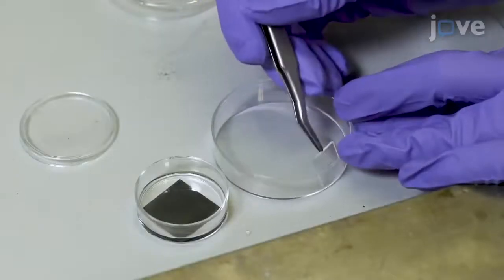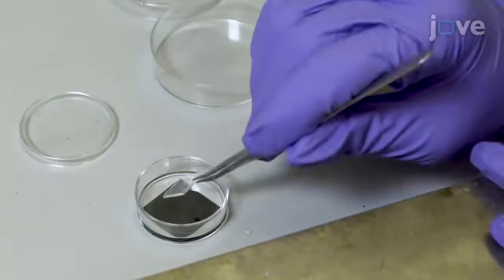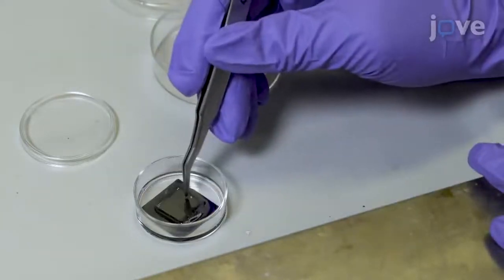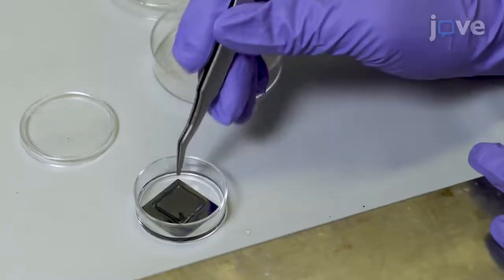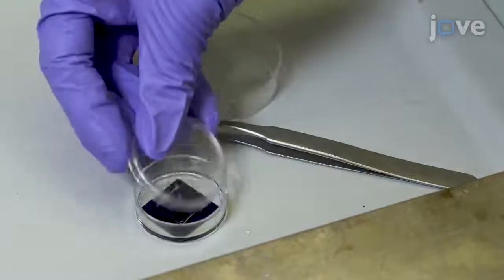After degassing, carefully place the slide on the PDMS with the treated side facing down. Gently press the slide onto the silicon master to remove trapped air and to ensure that a uniform layer of PDMS is sandwiched between the master and the slide.